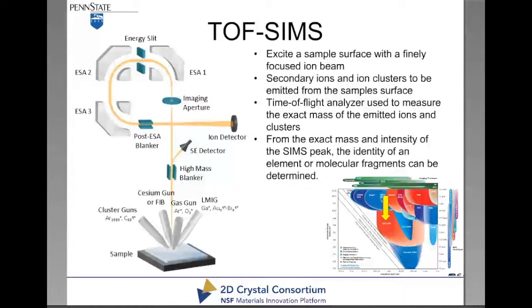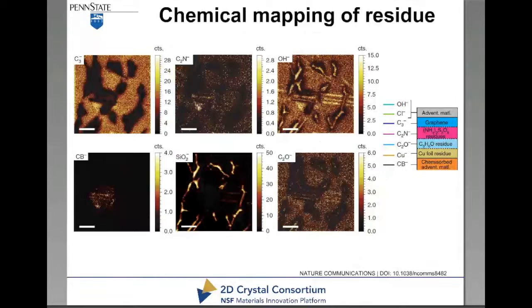But we're able to knock out 35 of the elemental impurities simply by going from a metal organic to a pure gas type system. So we would have never known this if it weren't for the use of ICP mass spec to really understand the impurity levels in our systems. So it can be a very powerful tool so that we can better understand the method or the impurities in these systems.